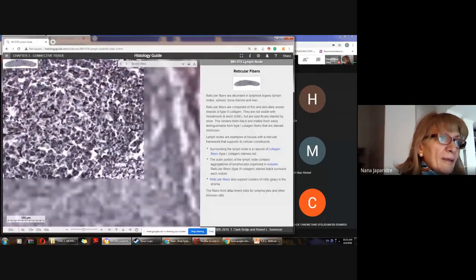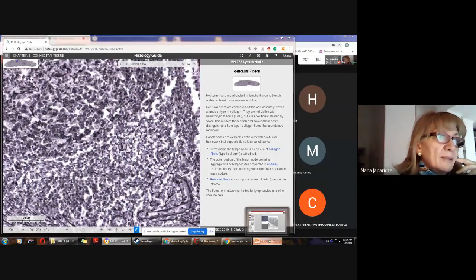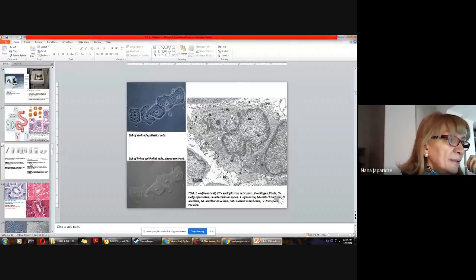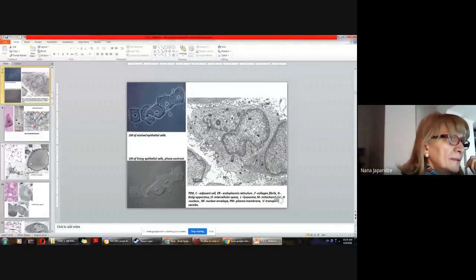Okay? So I want to show you also nerve cells stained with silver. I think I should have this here.